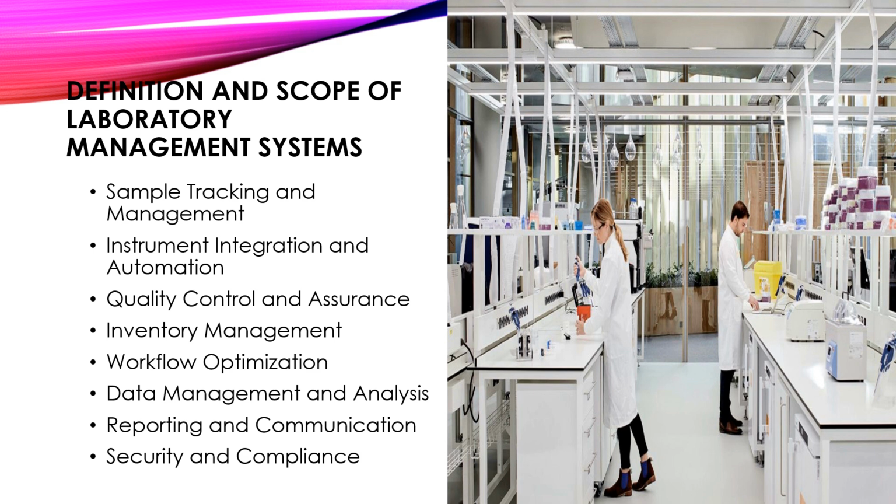Quality control and assurance. Laboratory management system facilitates adherence to quality standards and regulatory requirements by enforcing standardized protocols, managing documentation, and tracking quality control measures. It helps ensure accuracy, reliability, and compliance with industry regulations and accreditation standards.